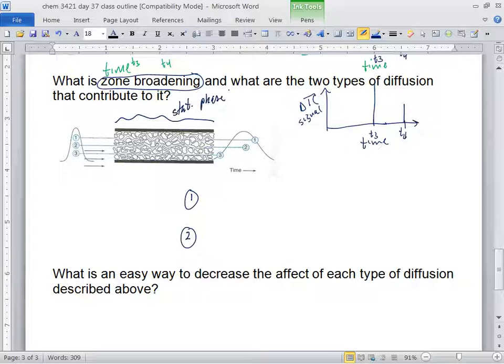That whole thing right now is our stationary phase. And then these little blocks in here, you can see them, and they're all these different shapes. That's, again, the stationary phase. And it could be acting like a filter, like if it's size exclusion. It could be coated with some material, and then like dissolves like and changes that coating. But that's what they're trying to say the stationary phase is made up of. It's made up of all this packed stuff. You really don't know what it is. But 1, 2, and 3 are supposed to be different paths, where some paths are longer than others.